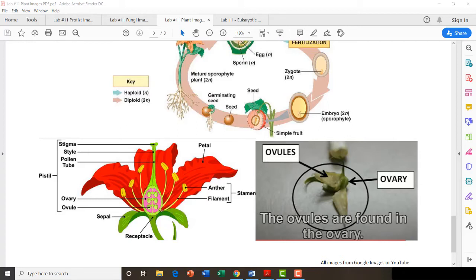Over here, these long structures coming out are called the stamen. It contains the filament, and at the top, the anther. The anther contains the pollen, or the male gametophyte. The pollen would come and land on the sticky stigma and fertilize this flower. So you would take your flower and literally cut the ovary in half. Here is a screenshot of a YouTube video of them doing a flower dissection. You didn't have to watch the whole thing; I just cut to the chase.